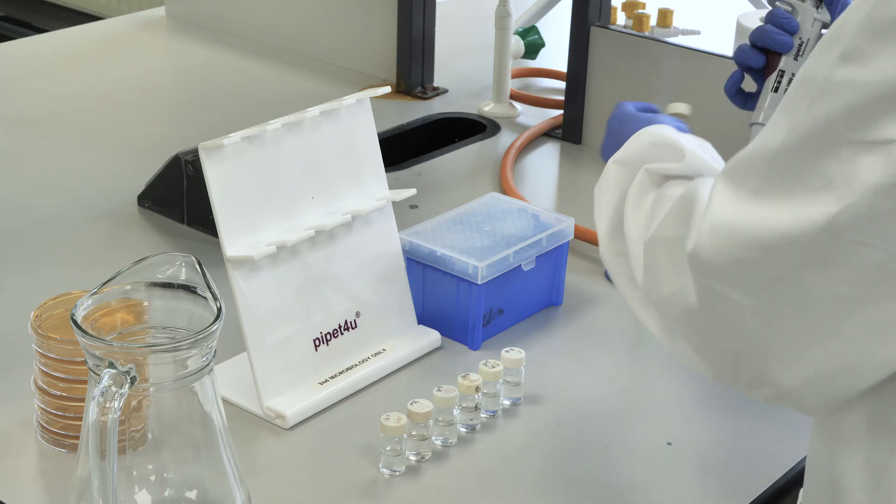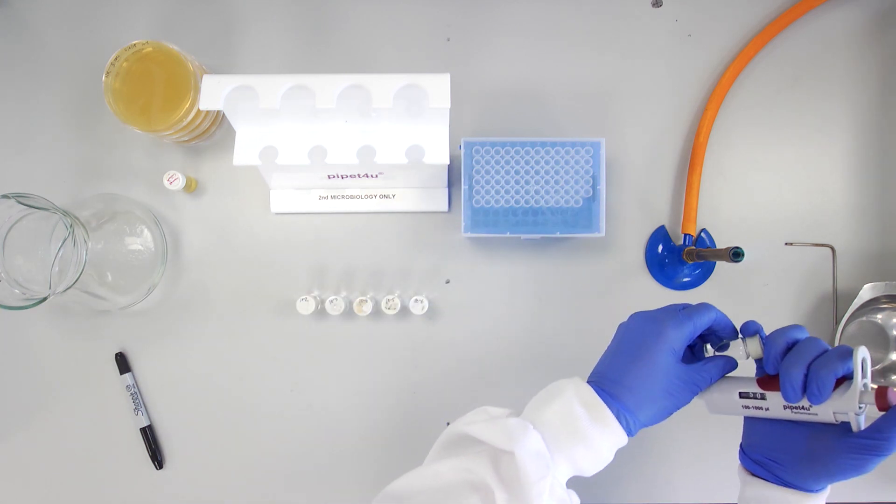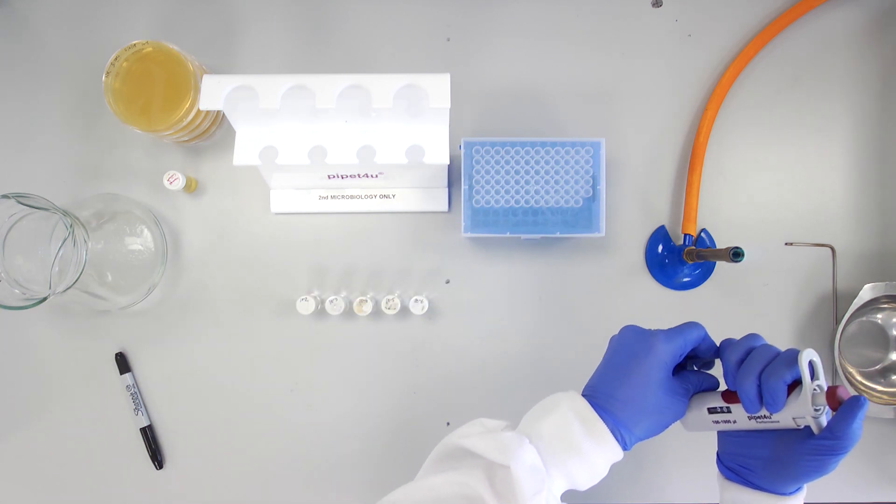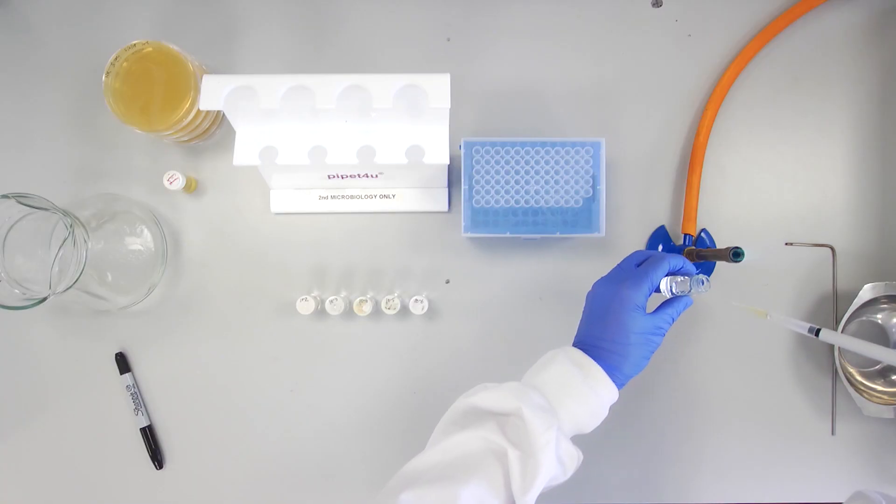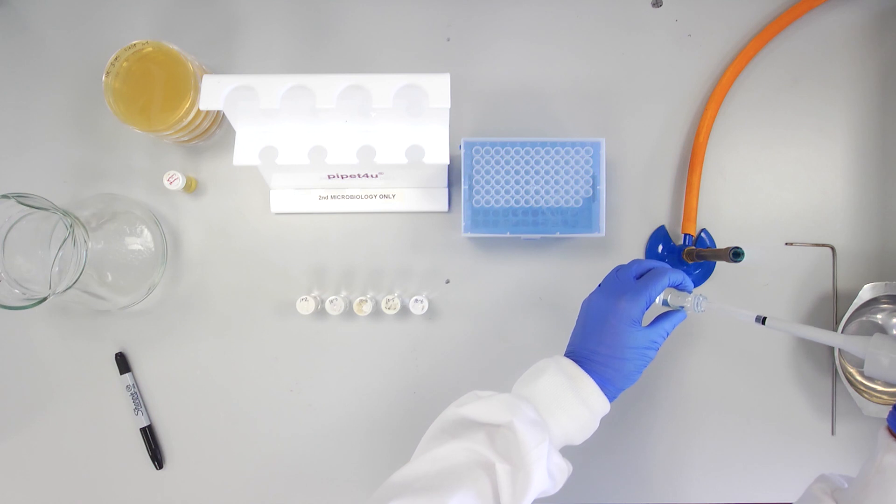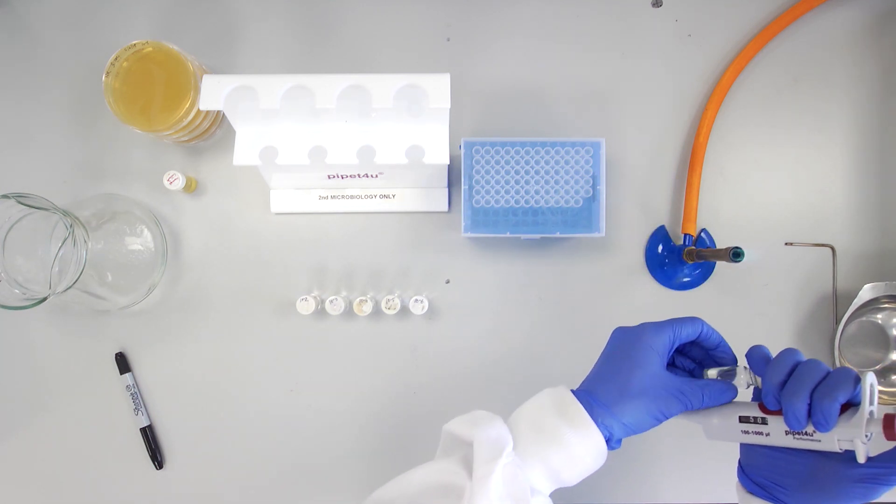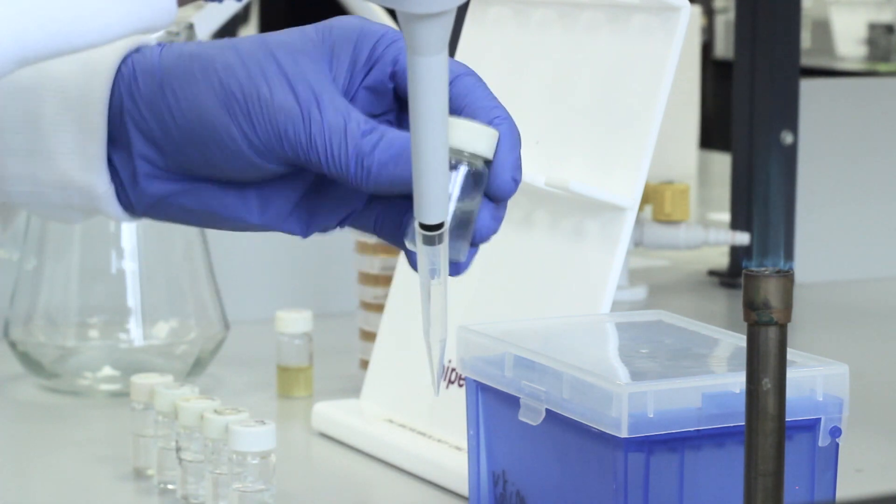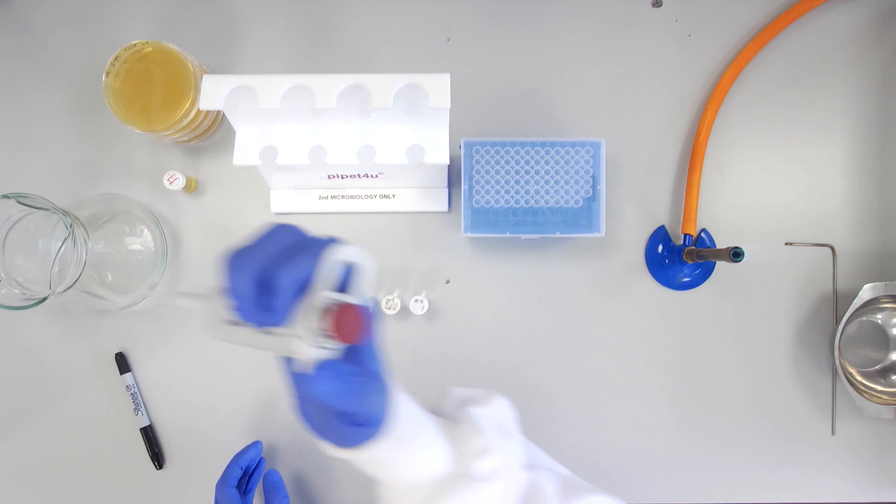Transfer this 500 µl of the overnight culture into the first of six 4.5 ml saline bijoux, again using aseptic technique. Mix the culture suspension well by inverting three times. This is the 10 to the minus 1 dilution.